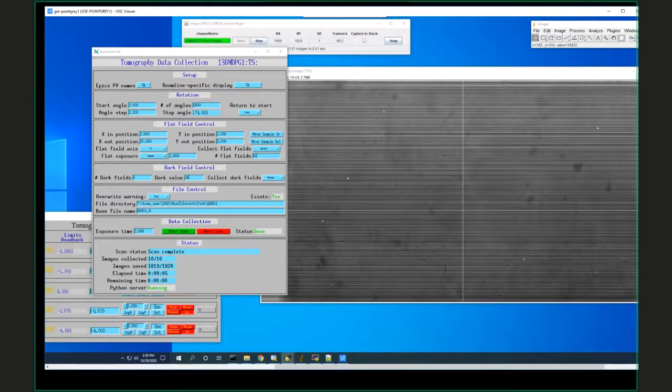So for some reason, you expose it to beam and it pumps it to become more optically fluorescent, with more intensity. And you can imagine that if that's happening as you put a dark part of your sample in, it could be leading to artifacts, because the scintillator gets less sensitive when it's exposed to darker areas and more sensitive when it's exposed to brighter areas. But I don't know how significant an effect that is in real data collection.